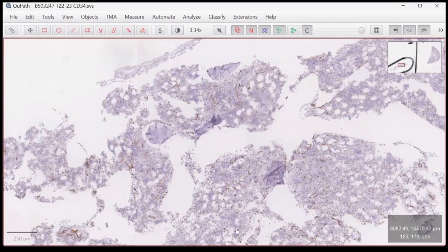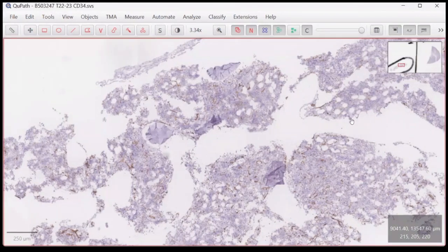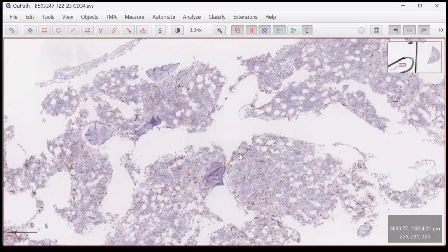One more marker that will help you confirm whether this is residual disease or hematogones is CD20. We expect CD20 to be far lesser than PAX5, because PAX5 and CD79a are similar markers of immature cells. They can cover immature and also mature cells, but CD20 only expresses in the more differentiating, more mature cells.